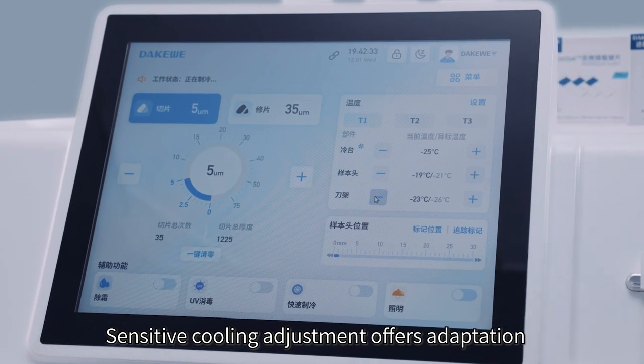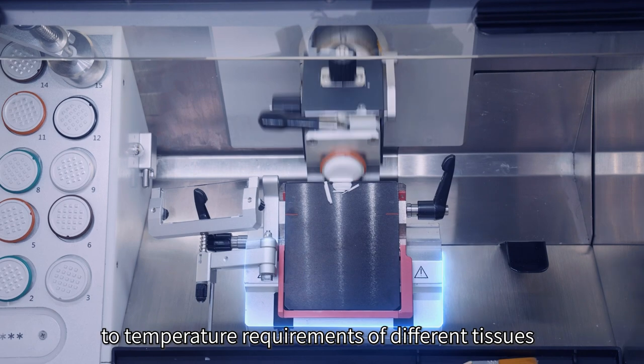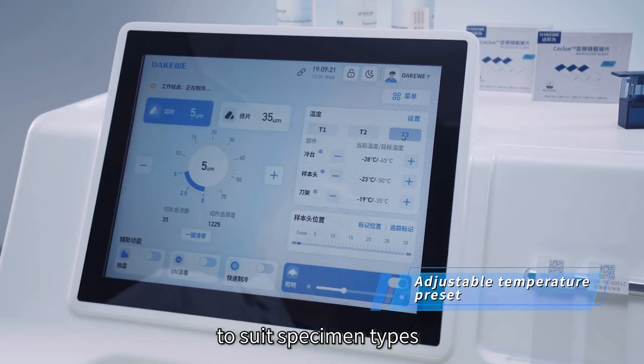Sensitive cooling adjustment offers adaptation to the temperature requirements of different tissues. Choose freely from three presets of component temperature to suit specimen types.